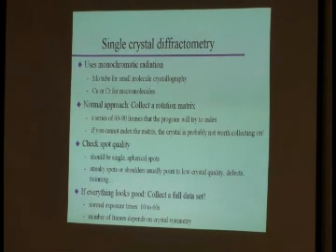We know from our derivation of reciprocal space scattering that you should have nice single spherical spots if you have a single crystal that has a decent number of repeats in all 3 dimensions. Right? That was the solution of our general scattering equation in 3 dimensions. If you have streaky spots or shoulders, something is wrong. Okay?